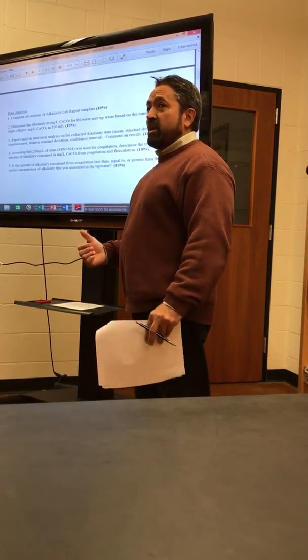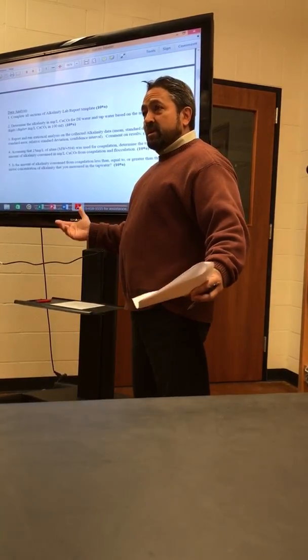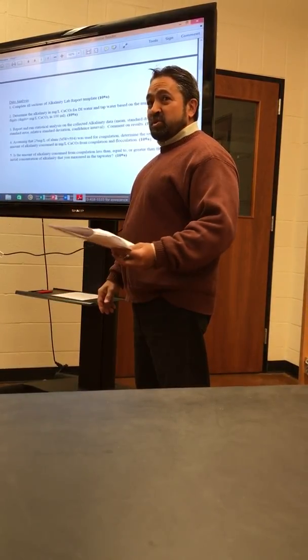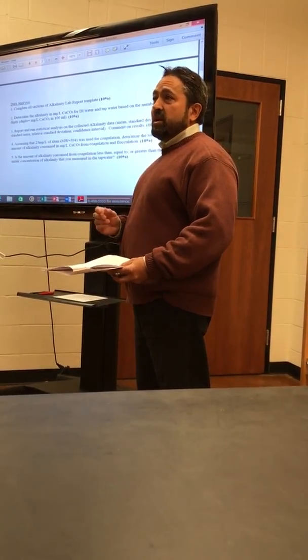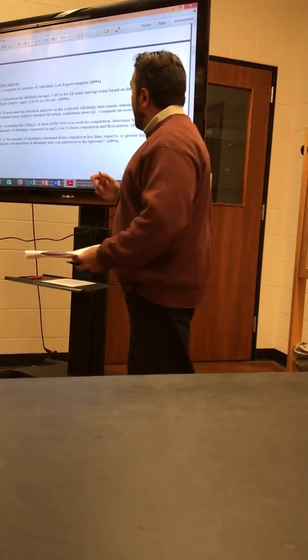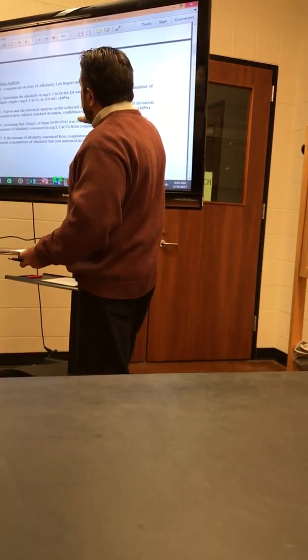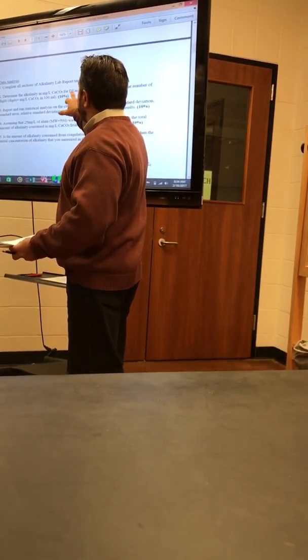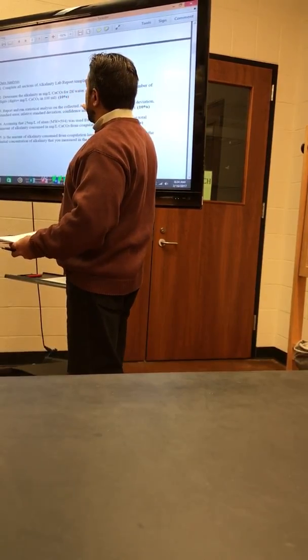there. There's no calibration today because you're not using any equipment. So there's some good news, okay? No standardization, no calibration. It's just your eyeballs. This is all about color change and kind of seeing when the color changes based on the pH change, okay? So completeness, determine the alkalinity in milligrams per liter of calcium carbonate. So skip that DI water, just going to be tap water.